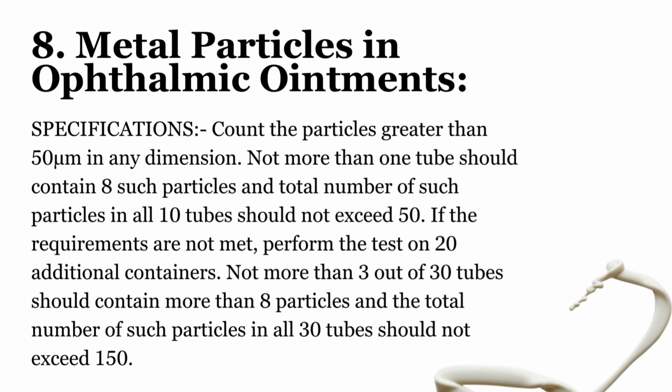Specification: count the particles greater than 50 micron in any dimension. Not more than 1 tube should contain 8 such particles, and the total number of such particles in all 10 tubes should not exceed 50. If the requirements are not met, perform the test on 20 additional containers. Not more than 3 out of 30 tubes should contain more than 8 particles, and the total number of such particles in all 30 tubes should not exceed 150.